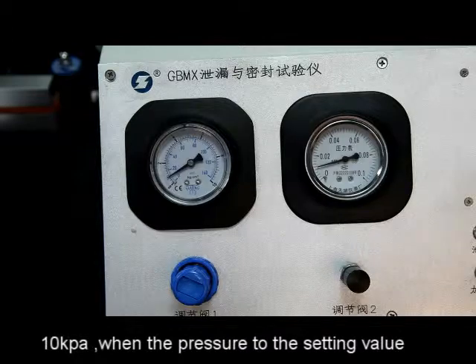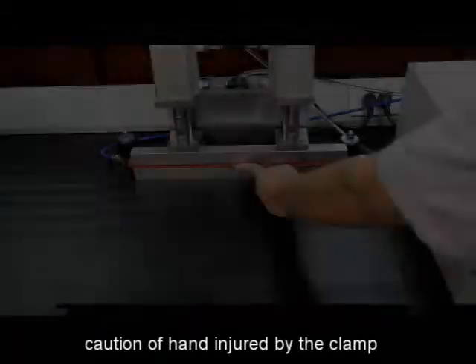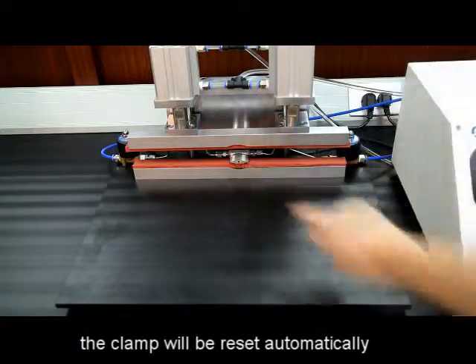When the pressure reaches the setting value, it starts timing. Caution of hand injury by the clamp. When the testing time reaches the setting time, the clamp will reset automatically.